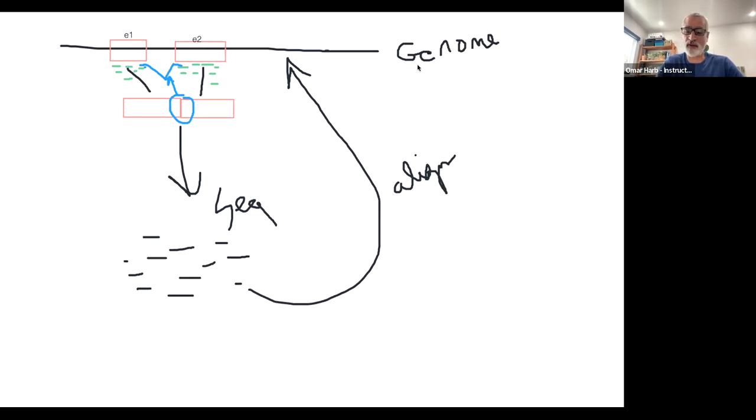All right. So I'm gonna stop the whiteboard sharing. Hopefully that wasn't too terrible, but hopefully you got the point that we can take this information that we get from the reads that are coming out of the transcripts, and we can align them back to the genome, and we can use that information for different things. So the reads that are aligned to the exons tell you something about the expression of the exons. The reads that align to the junction will tell you something about the evidence as to whether the intron exists.